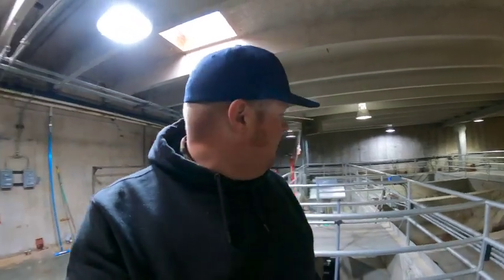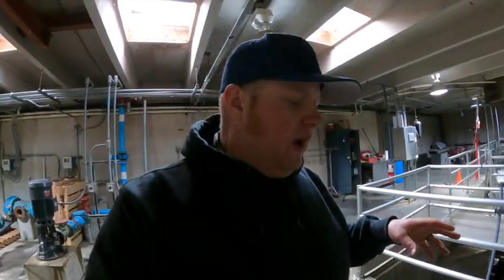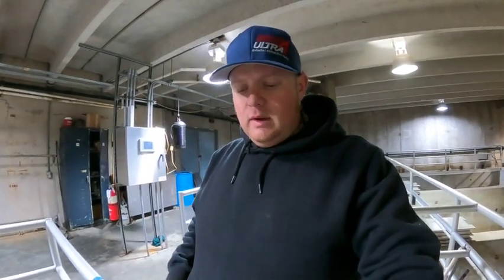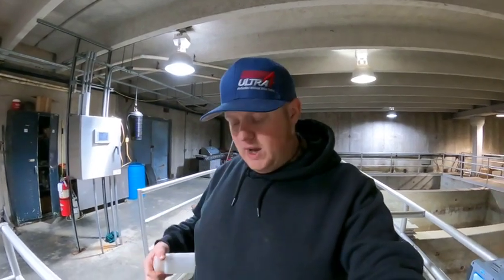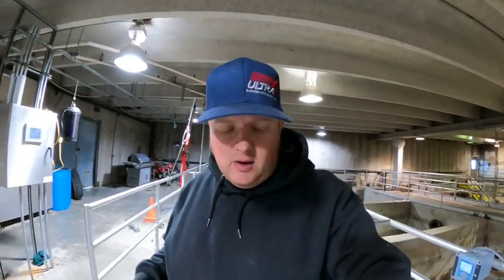I'm going to get my effluent sample here. I'm just going to talk a little bit about the discharge part of a wastewater treatment facility. You have two permitted features in a sewer plant, right? You have where it comes in, that's your influent, and then you have your effluent, or what leaves the plant. So we are now at station 001A. It is an official designator registered with the state health department.